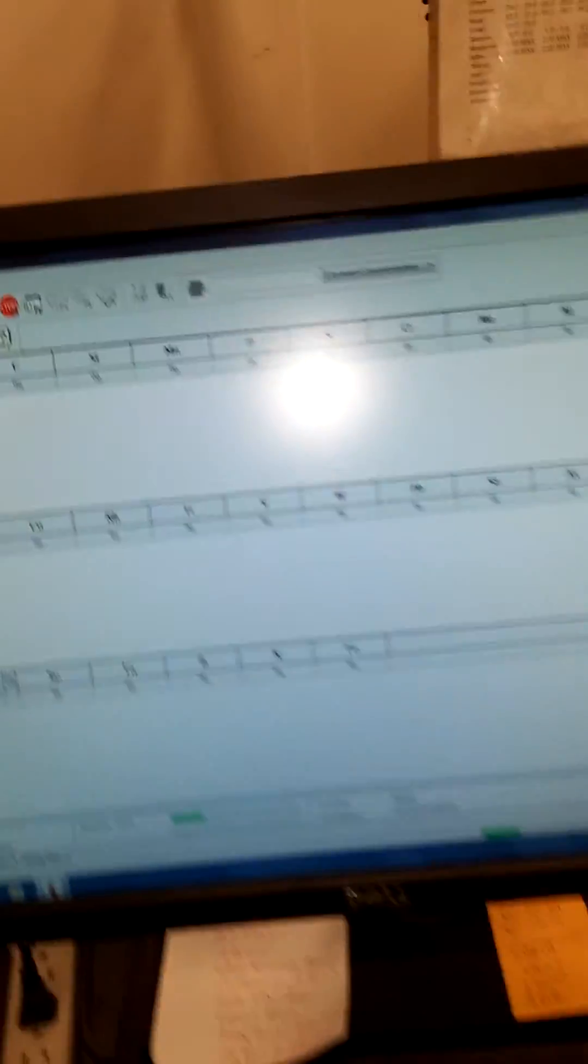Hit F2 and this is all of our ASTM standards right here. It tells us what everything needs to be. This is HK metal I'm making right now. It's a low alloy stainless.